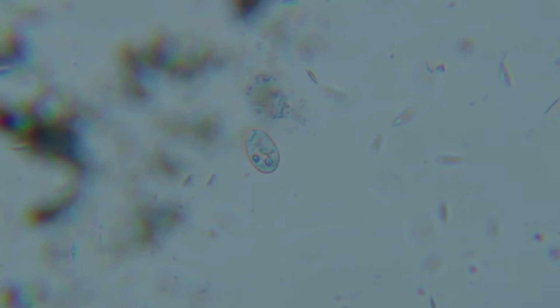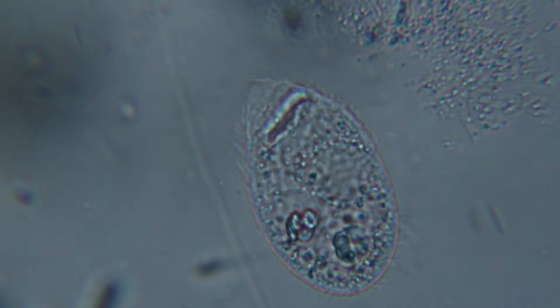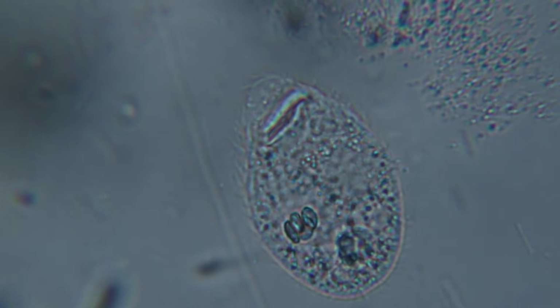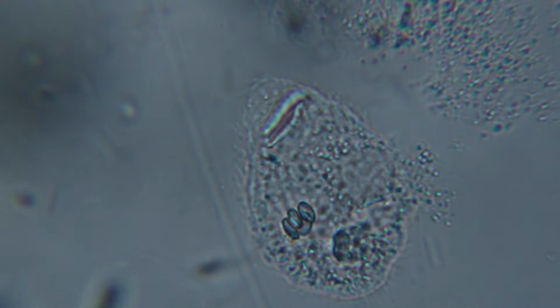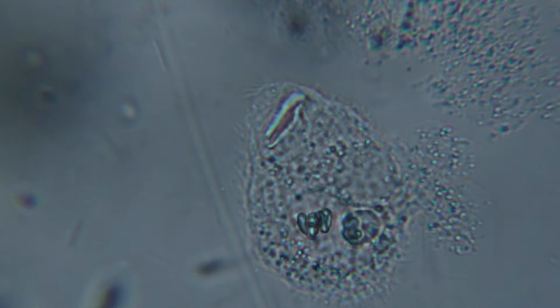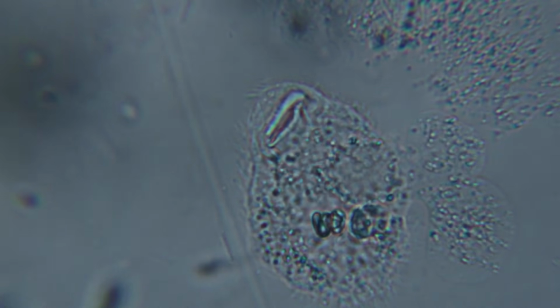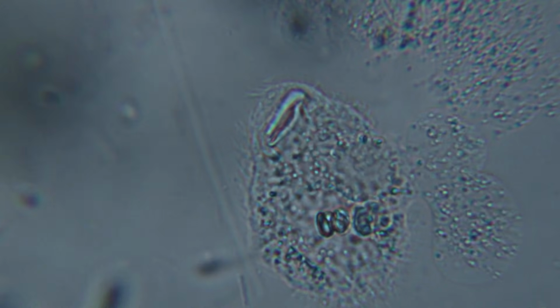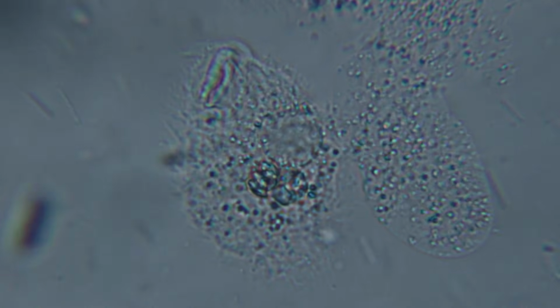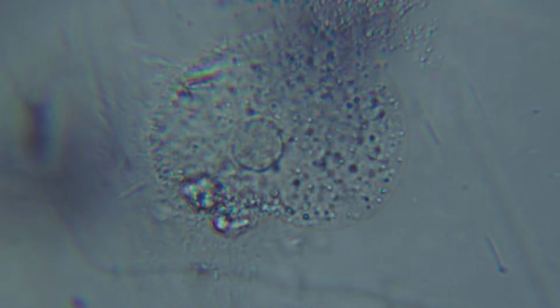I found this Paramecium which was stationary, and then I was lucky enough to observe this. Now whether the Paramecium is dying and has some sort of bacterial infection, or if it was actually reproducing, I was not 100% sure, as I was not able to observe the end of this process. If you have any ideas, let me know in the comments below.